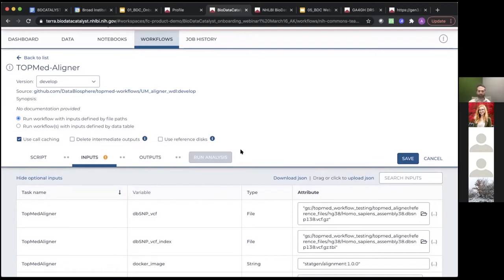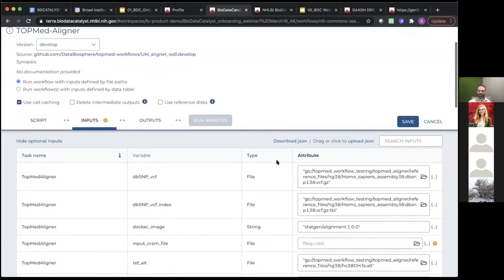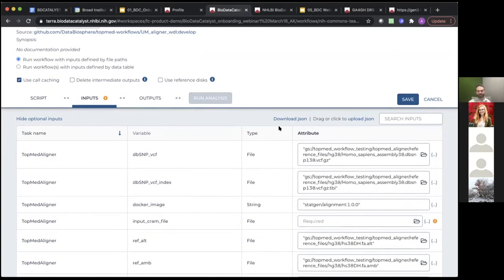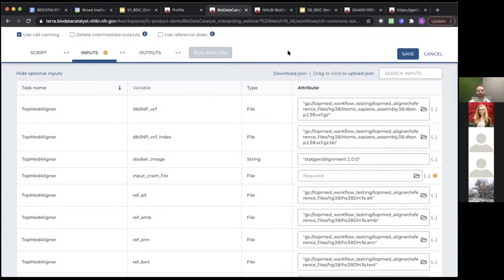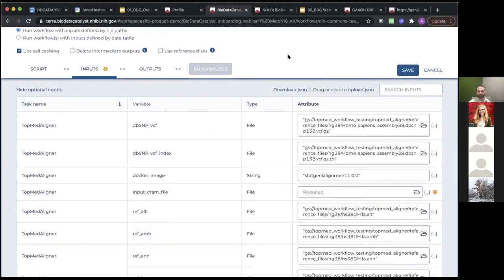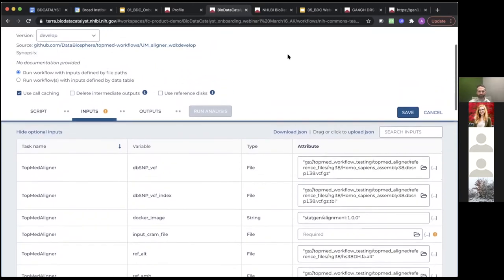Before you can run analysis, make sure all required fields are filled out — there's a warning sign if they're not. You can save configurations by downloading a JSON file. A JSON file contains all of the attributes for running a workflow — it's a way to save the wiring of the workflow, what are the inputs and what are the outputs. JSON files are a general format used a lot in modern cloud-based computing — essentially a text file that matches data with a label.